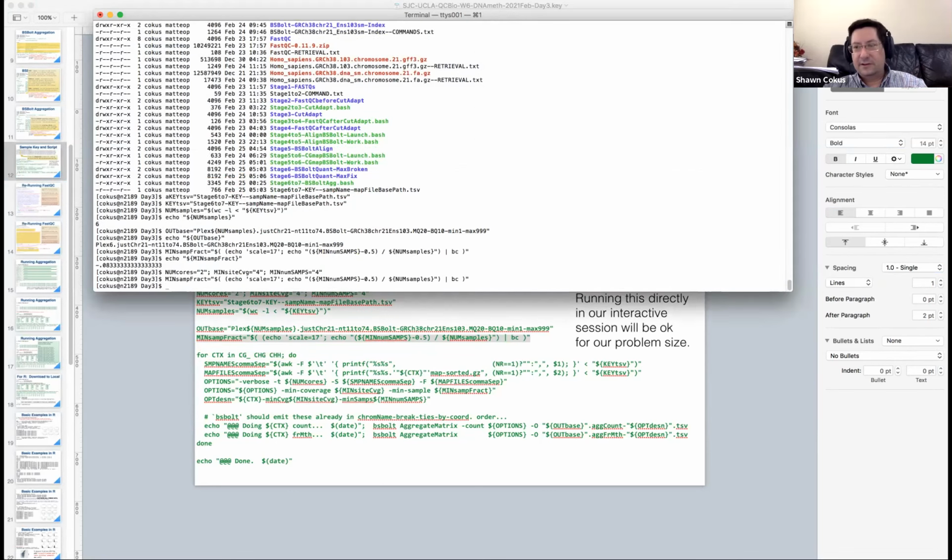This is another way these scripts don't usually come out whole on the first go, right? You develop them interactively here, and then you're working on the final version here. It takes a couple of iterations sometimes. So while you're working out how the script's going to go, you do it like this, and then as you get your lines right, you copy them down into your script file. Okay, so there we go.